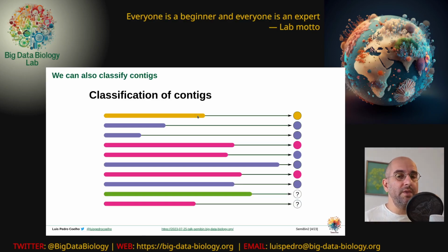But there's two issues with this. So number one, our sample might contain species that are completely unknown. So maybe the green species is not even in our database, so it's impossible for the classifier to output a label that it doesn't even know is a possibility. The second one is the magenta, where the classifier does know about magenta, but bacterial strains have a lot of variation, and so it might be possible that we have this magenta strain or magenta contig that is just so different from the magentas that are in the database that the classifier cannot assign it.